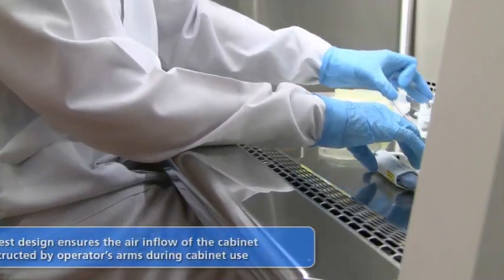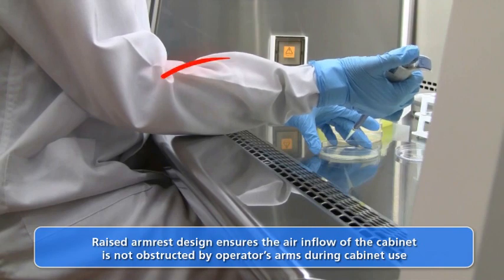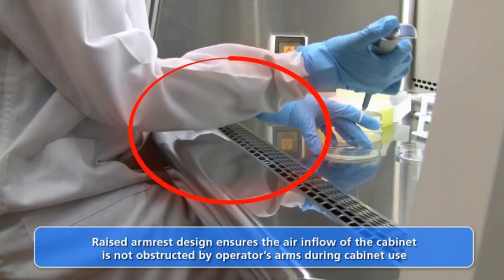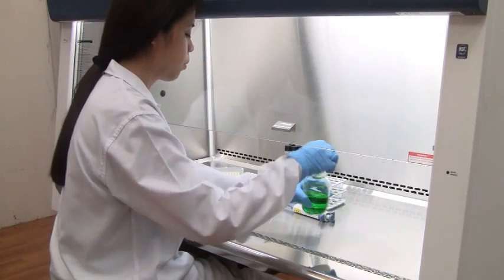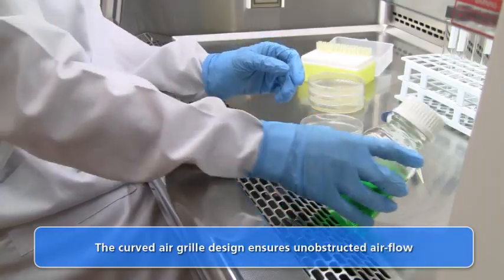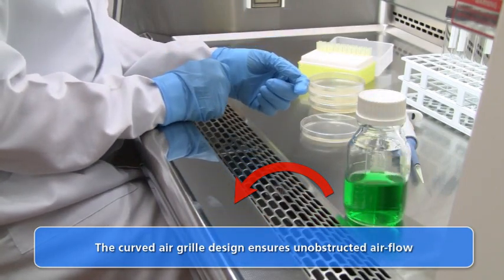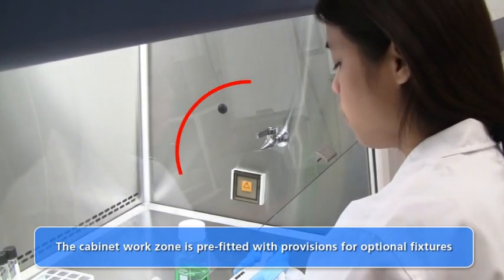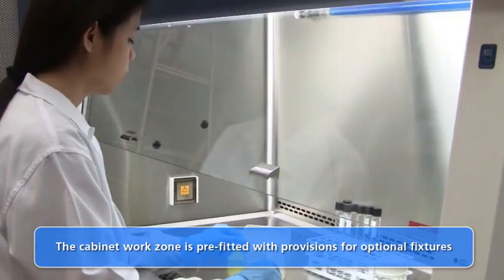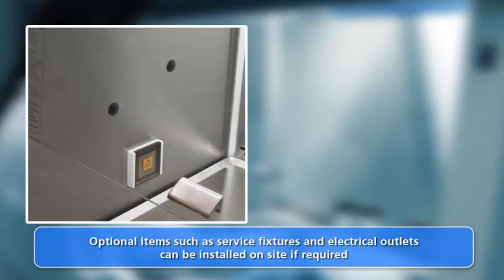The stainless steel armrest is raised above the work surface, which ensures that the operator does not block the inflow grills while working in the cabinet. The air inflow grill design is curved to prevent objects from causing disturbances to the air intake. The LabCulture Cabinet may be fitted on site with accessories after purchase, with no modifications to the cabinet body necessary — simply install the accessories in the pre-fitted provisions.